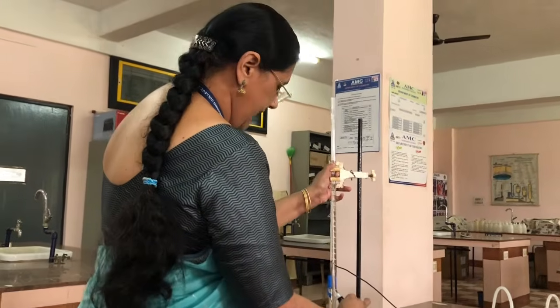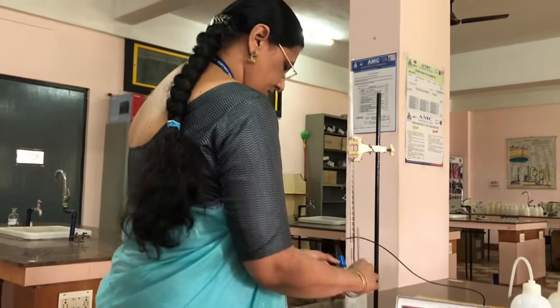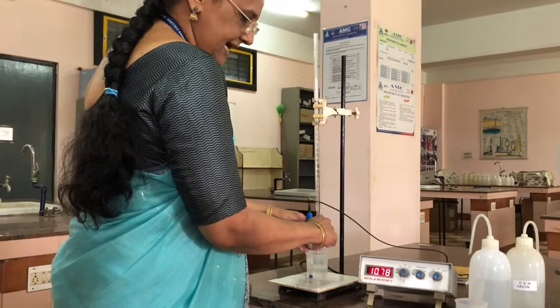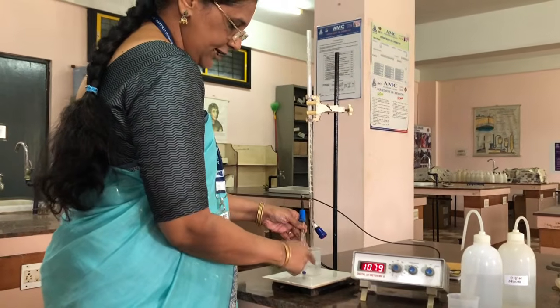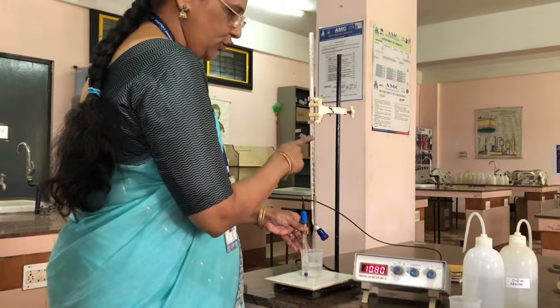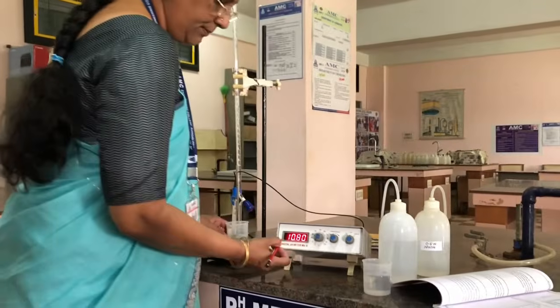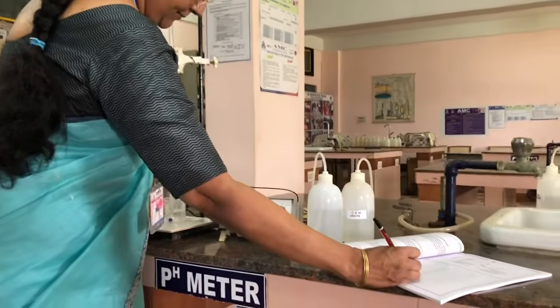After this we have to add again 0.5 ml increments and shake the solution and note down the readings. But you will not observe now a drastic change in the pH because there are no more H plus ions present in the solution. All H plus ions are completely neutralized by the base. That's why you will not observe a change in the pH. Now it completely comes to basic medium. So now it is again 10.8 only.